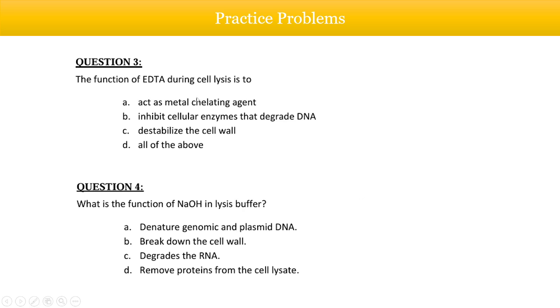Next, the function of EDTA during cell lysis. What is the function of EDTA?